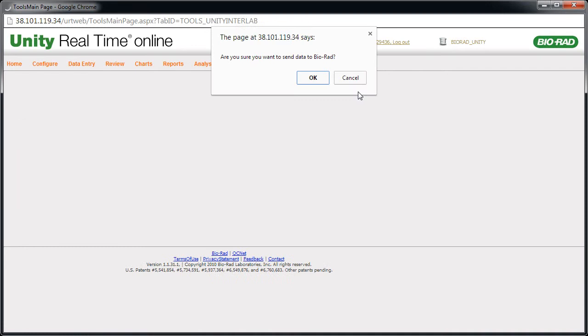A dialog box appears, asking if you're sure you want to send data to Biorad. Click OK.